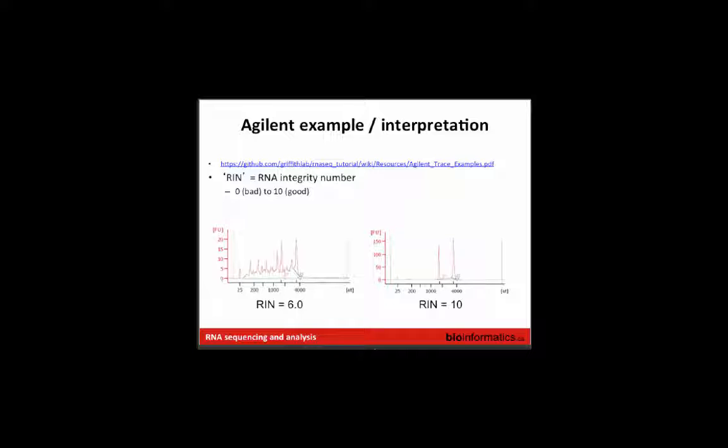But it's sort of related to my last comment. You probably don't want to do it on some of your samples and not others and then try to compare them. It needs to be consistent. But if you have good quality intact total RNA, and you're interested in messenger RNAs, things that are going to be protein coding maybe, a lot of people will still do the mRNA-seq just because it reduces the amount of sequencing that you need to do.